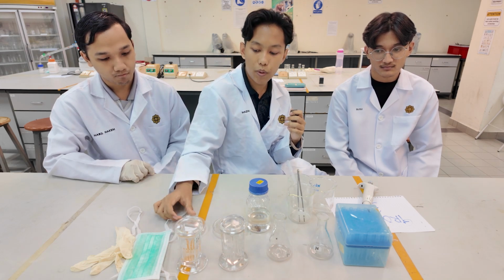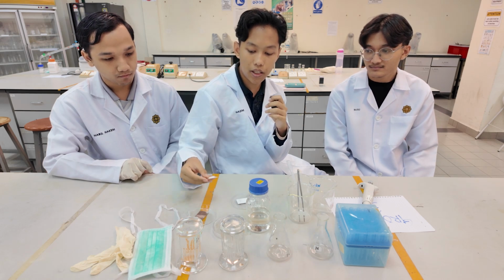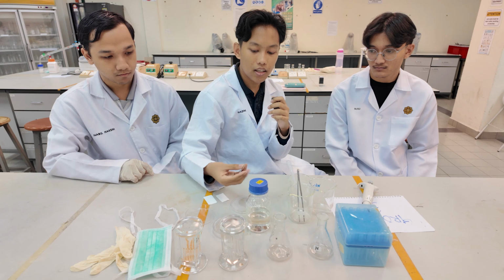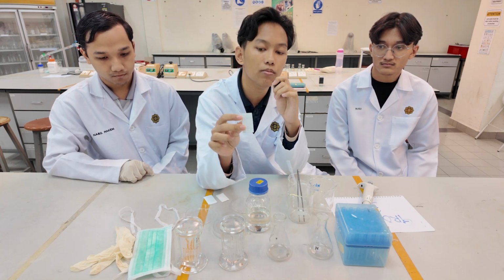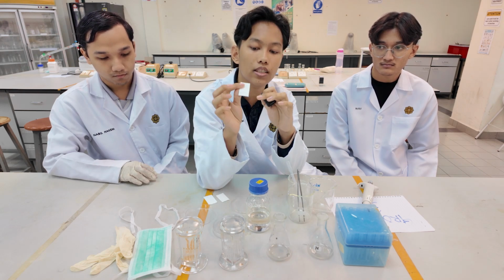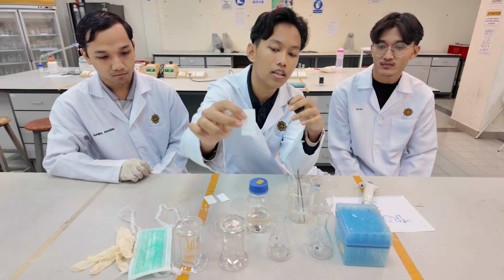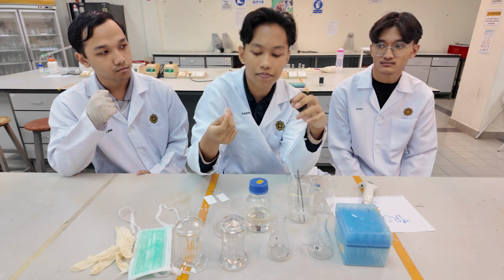Next, we prepare the TLC plates. We have 2 pieces, and we need to label them. We draw a straight line 1 centimeter from the bottom and 1 centimeter from the top for measurement purposes. Next, we also label the spots where we need to spot the acid, base, and neutral on the line. As you can see, we label them as A, B, N.